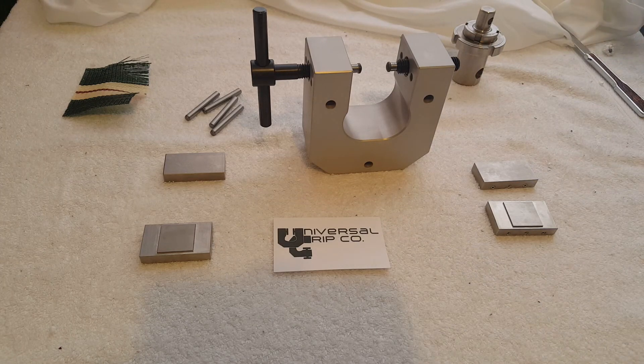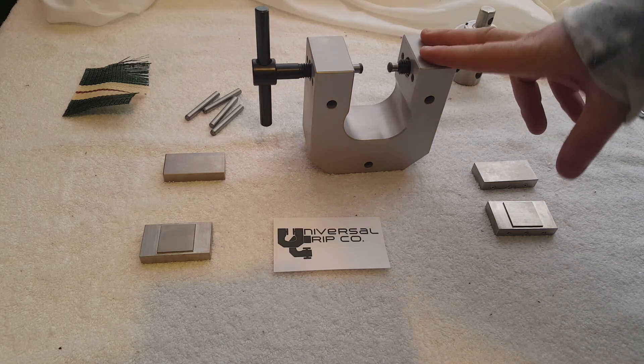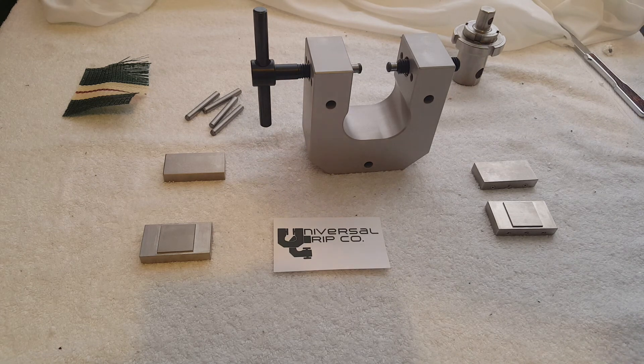Hello everyone. Today we are demonstrating our vise grip for testing ASTM D751, which specifies a tensile test for coated fabrics.